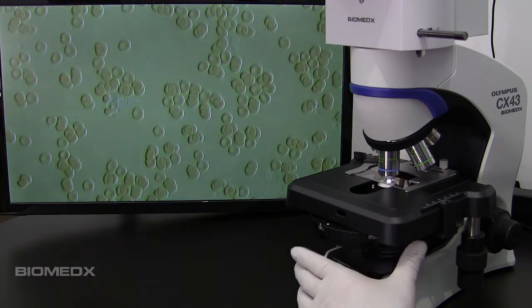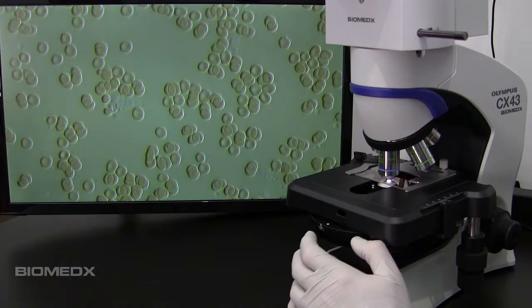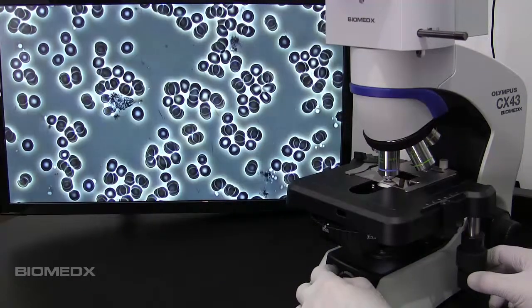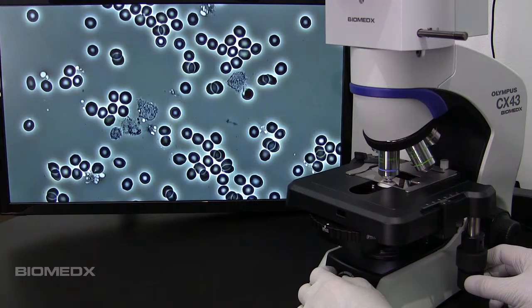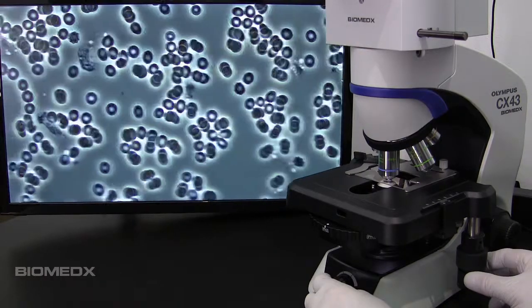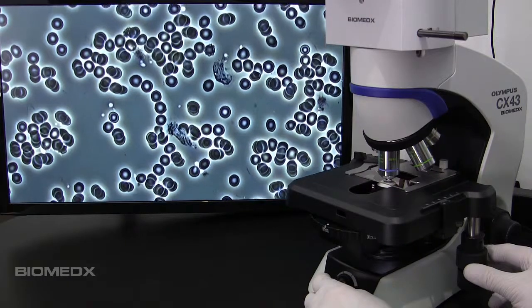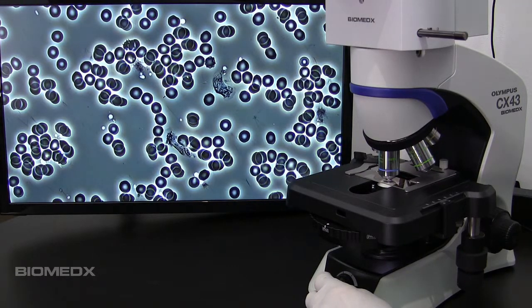On our older microscopes that were discontinued at the end of 2017 we used prosumer camcorders on those. But on these new microscopes we had to shoot for an increased individual pixel size with a high dark signal sensitivity. That was needed to get the level of dark field that I wanted. It took a lot of months of bringing in many different cameras and testing them all. I have been doing this since 1995 and well I am a bit particular where quality is concerned.